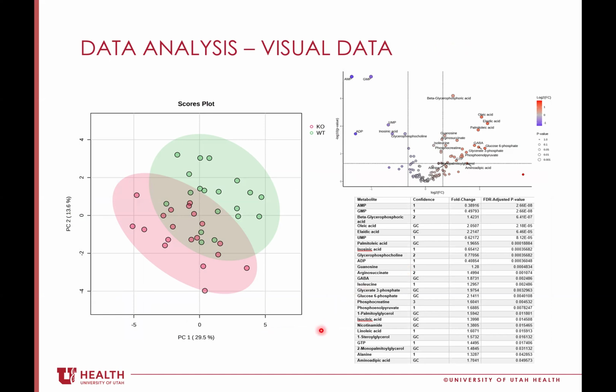I would guess that an important part of this is contextualizing normalizations to something of interest, so that if you use a group of molecules, you might get a more robust normalization about some other molecules being differential between your sample groups. But I'm just imagining that. I have no idea.